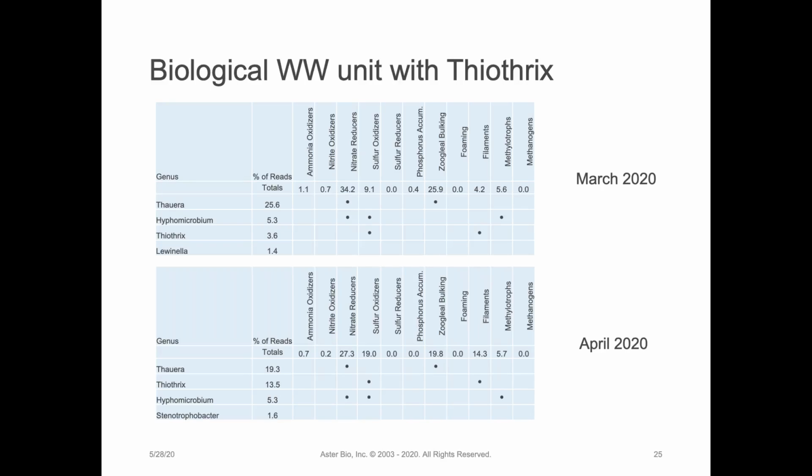And in this period of time, the plant noticed that the increase in Thiothrix caused real operational issues. Had they been tracking on a more frequent basis, perhaps weekly, they might have been able to catch the Thiothrix levels increasing before it caused major problems.